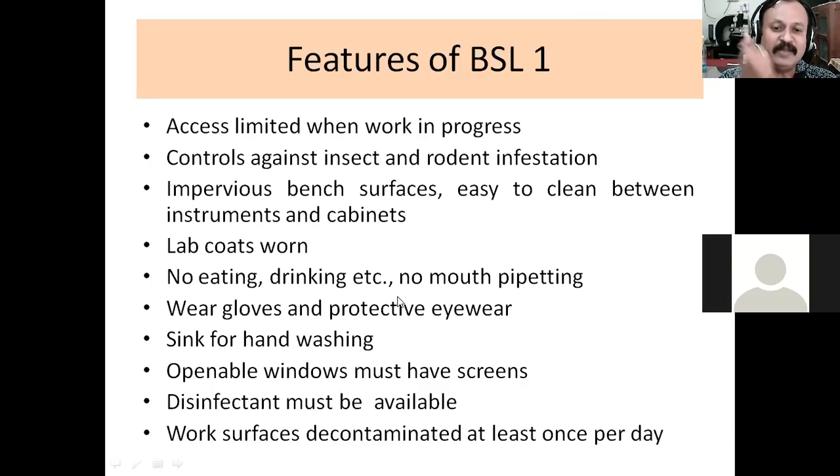So for pipetting purposes, there is a particular small device which is fitted on your pipette, and you can use that device to suck a liquid, pull a liquid, or dispense a liquid somewhere. So that is very important. And then you are supposed to wear gloves on your hands, and also you have to protect your eyes. You can use goggles or eyeglasses to protect your eyes.